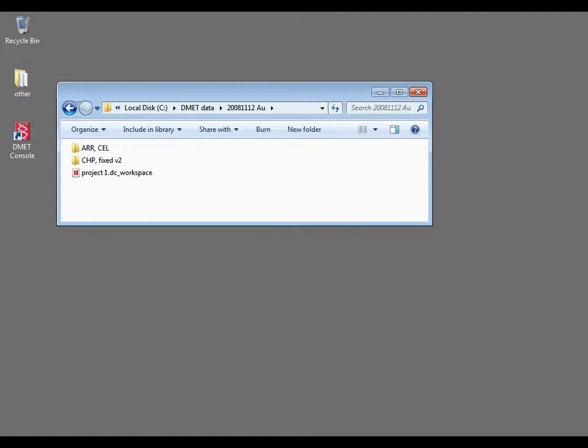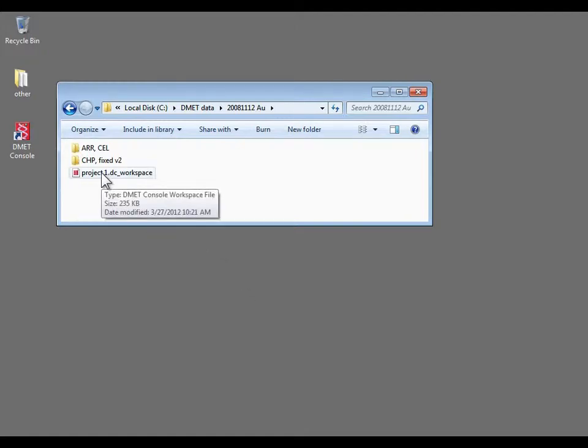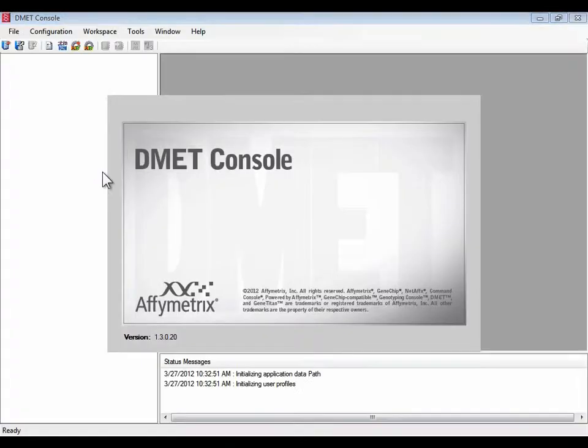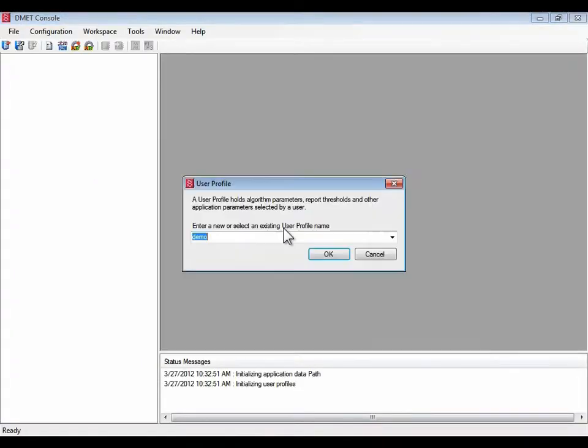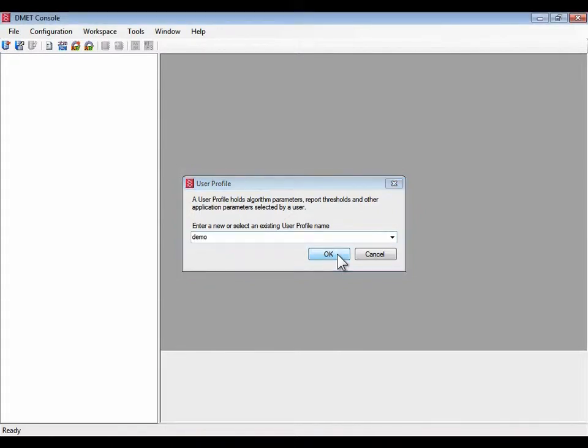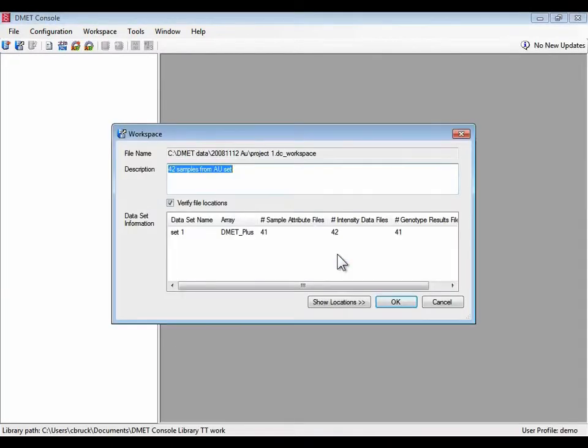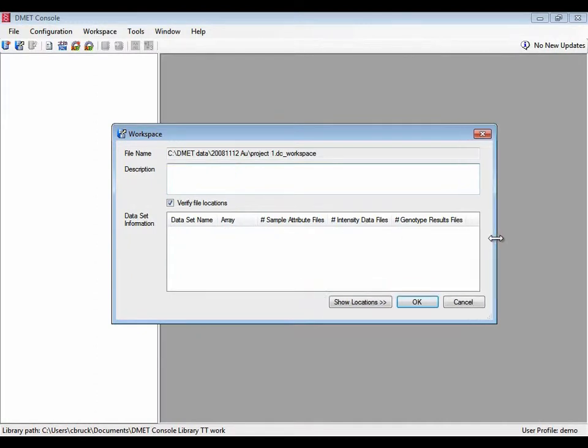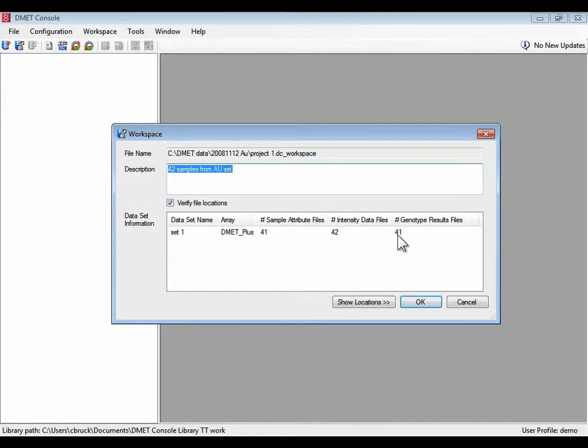Let's start by opening some existing data. I'm going to double click a workspace to launch DMET Console, select my user profile, and verify that this is the workspace I want to open. It has 42 cell intensity files and 41 genotype results files or chips. So we have some data that we can do allele translation on.